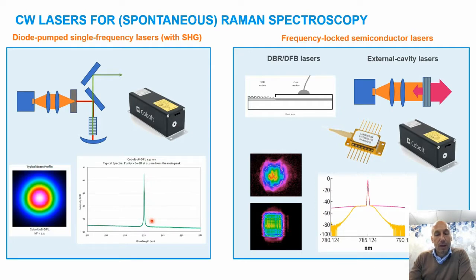Side emission from this kind of lasers usually comes from parasitic lines, and they are typically several nanometers away from the main peak and can easily be blocked off by dichroic cleanup filters.